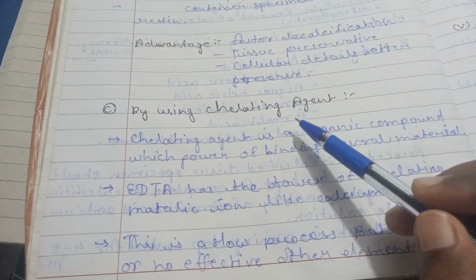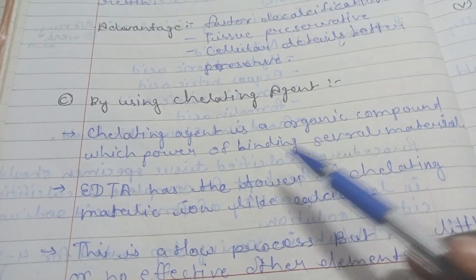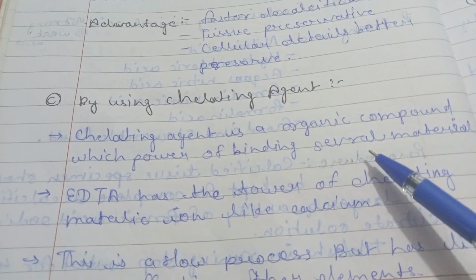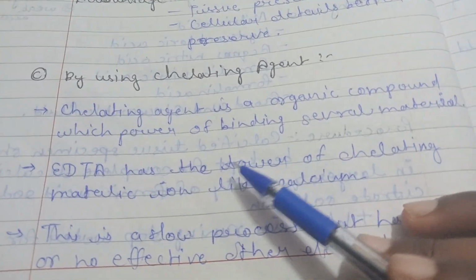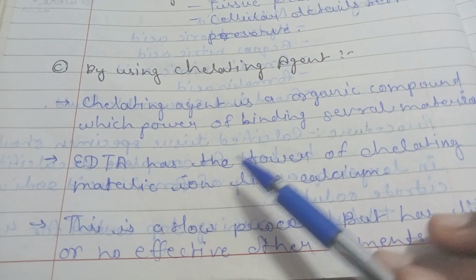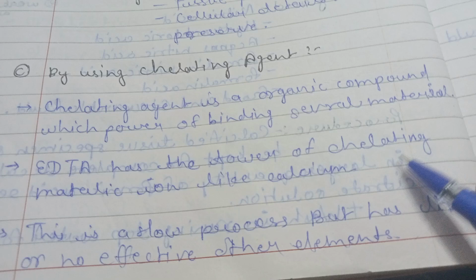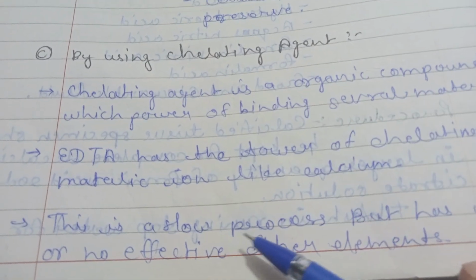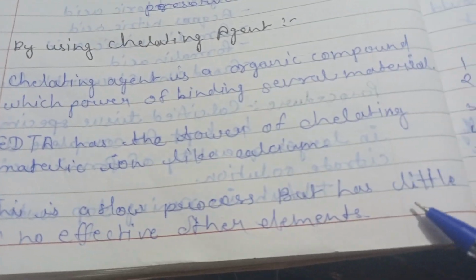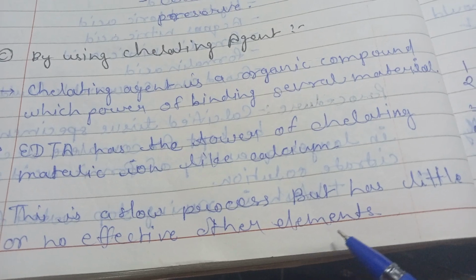And next, what about using a chelating agent? A chelating agent is an organic compound which has the power of binding several materials. Next point, EDTA has the power of chelating metallic ions like calcium. This is a slow process but has little or no effect on other elements.